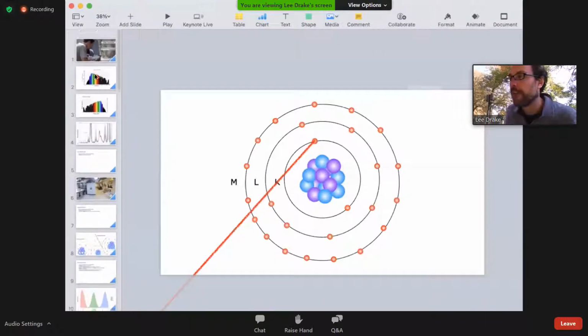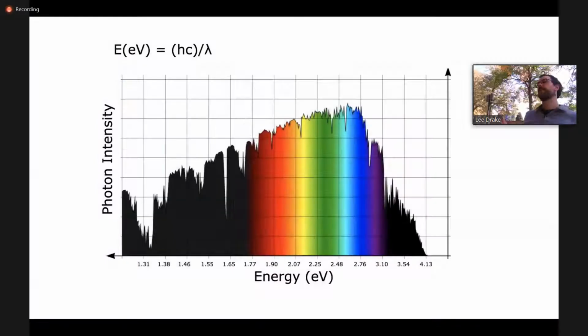Now, earlier, at the very start of this lecture, we talked about color fluorescence. When we're talking about color fluorescence, we were specifically talking about why the sky was blue, all that Rayleigh scattering, and why plants were green, because they take in that blue light and they fluoresce the green. The thing here is we have to send in more energy than we get out, right? I need to send in enough light to activate the chlorophyll, so I send in the blue, but then I get back the green, which is the color of the plant. You need more energy to excite. Well, in our filters, we're doing just that.